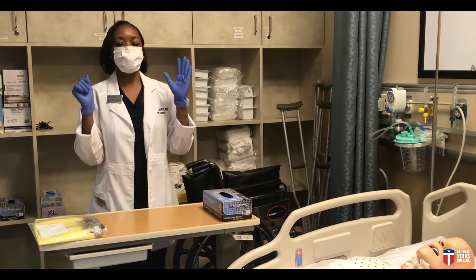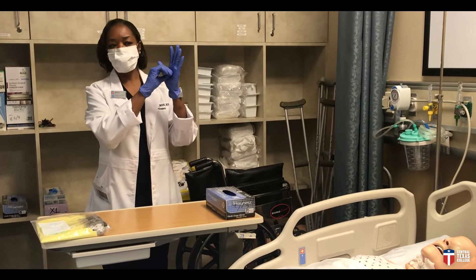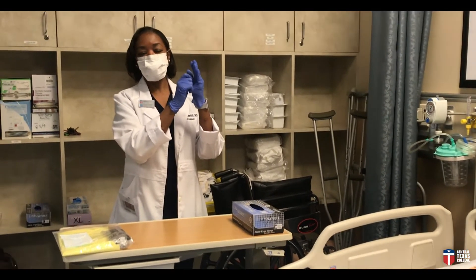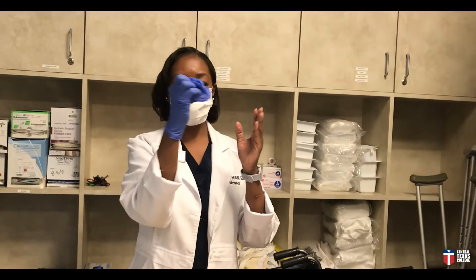To take off your gloves is where you need to be a little more careful. To properly remove your gloves, you first take the first glove and you pinch. Using your dominant hand, you pinch your non-dominant hand and you pull that glove off, holding it in your hand.